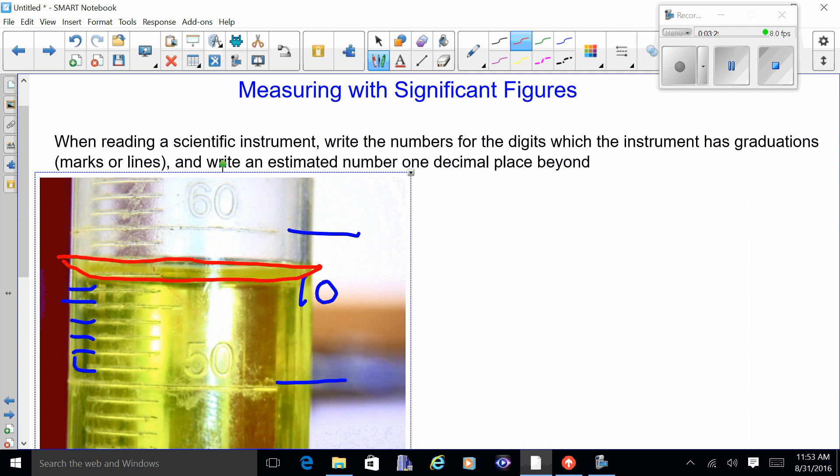I'm going to write down the numbers I know: the 50 and the 6 — so 56. Since the graduations represent the ones digit, I have to estimate one digit out beyond the graduations. I'm going to say it's 56 point 8 milliliters.